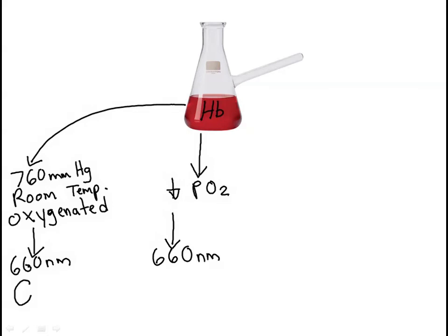And in our saturation equation, this absorbance value is B. And you'll repeat this step several times, each time decreasing the air pressure in the flask by a specific increment. And again, the absorbance of the sample after each pressure reduction is going to be the letter B in our saturation equation. Now, it's impossible to completely deoxygenate the hemoglobin sample using this method.